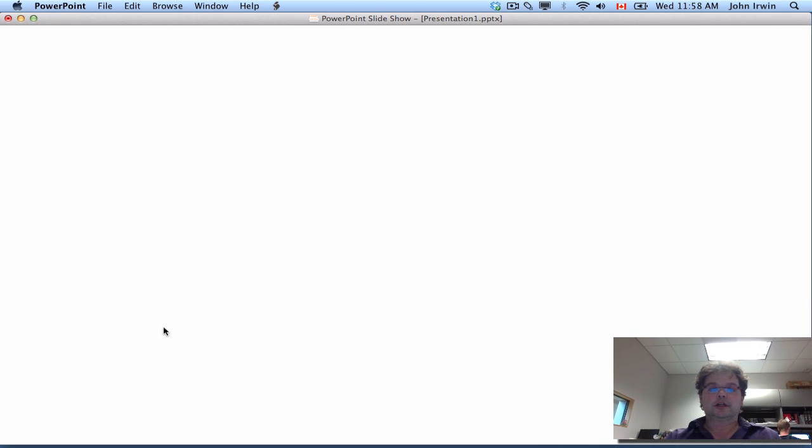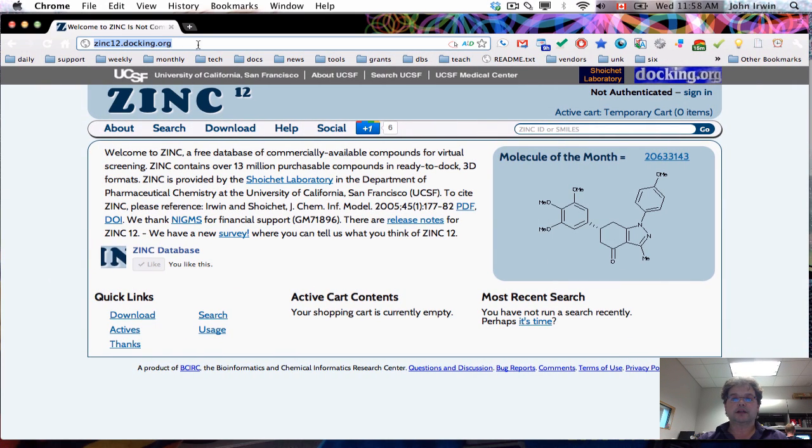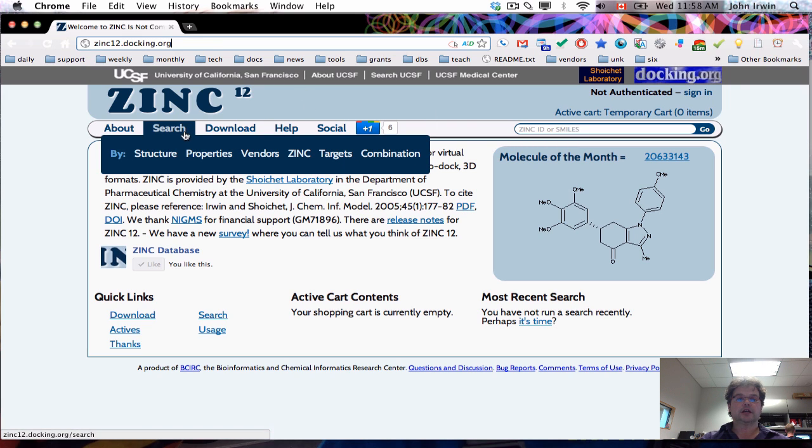So let's get started. We'll go to the ZINC website, currently in beta at zinc12.docking.org and you can see it's got a new layout. We're going to start with going to search, and of course you can search by the usual things - structure, properties, vendors - but today we're going to search by target.